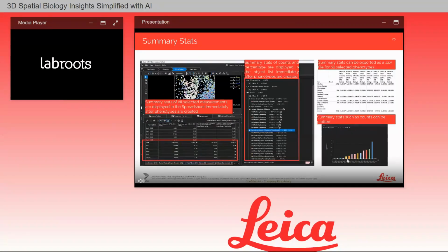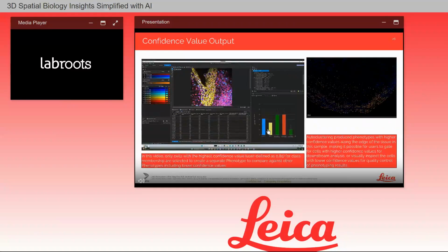As I mentioned, we have a confidence value output, which enables users to sort the confidence values that Aivia outputs for every phenotype, and users can choose to select the highest confidence items for further analysis. In this example, we're selecting 0.85 as a threshold and creating a new class, selecting only the highest confidence objects, which is done by gating, and do further analysis from there.